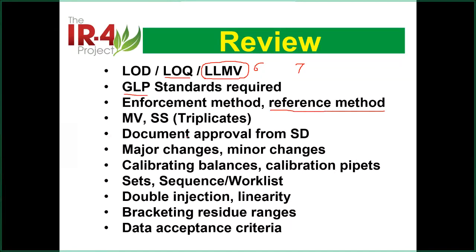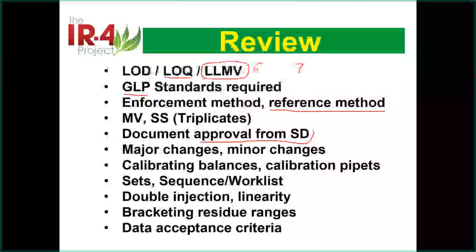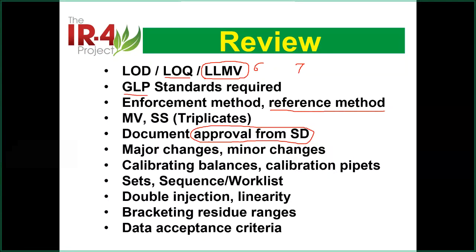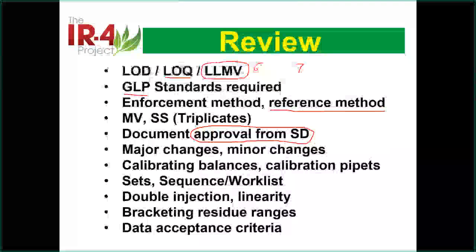Then we talked about method validation and even storage, which should be in triplicates. We talked about a lot of things about approval from the study director. And this goes with you when you do the GLP work or all those government-related, let's say registration-related, work for the residue work.